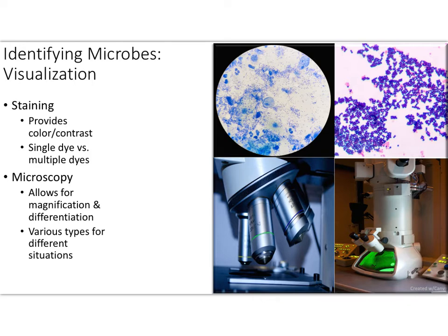In general, we can divide stains into two very, very broad categories. There are simple stains, and then there are more complex stains. So simple stains tend to use just one dye.